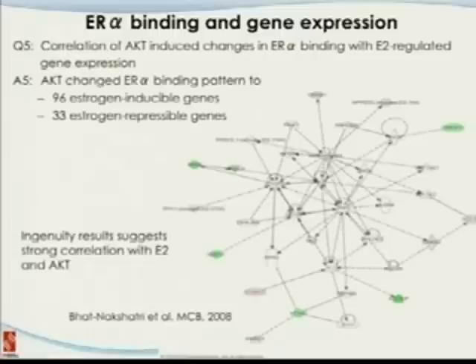Once we run through the Ingenuity Pathway Analysis, and you probably cannot see from the back, but you can read from the handout, this is the E2, and this is the AKT. So the genes that are differentially expressed are scattered around, but the two most important factors that we are studying here are something in the central. This really tells us the data is biologically significant, and it's really produced something that we expect. Of course, we want to learn more from that as well.